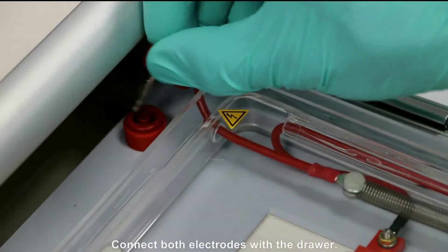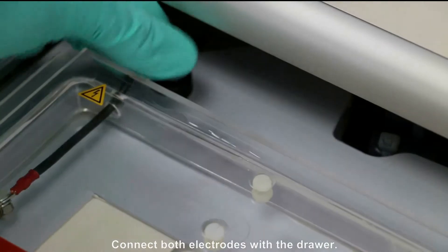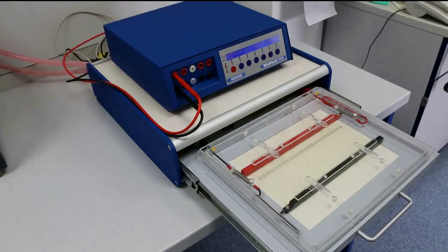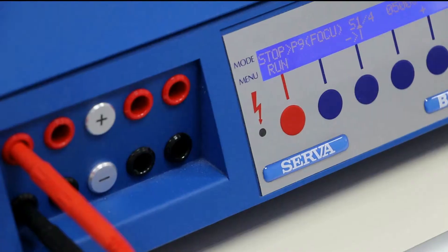Connect both electrodes of the lid with the system. Therefore, insert the plugs into the drawer's pins. Slide the drawer back into the unit and start the run.